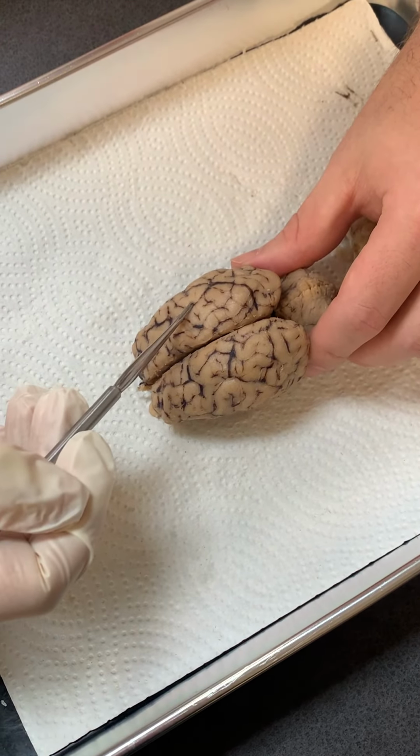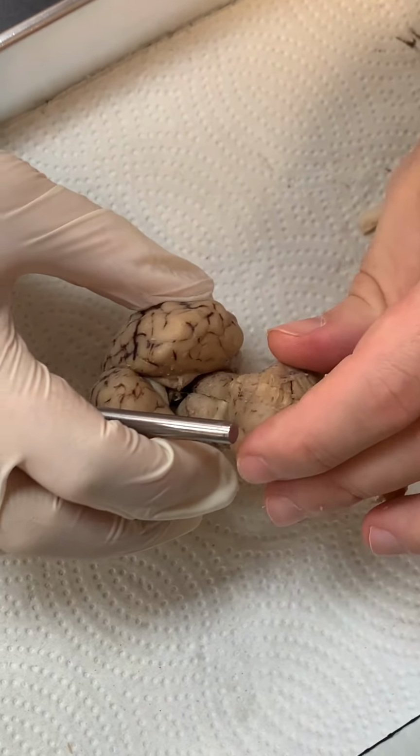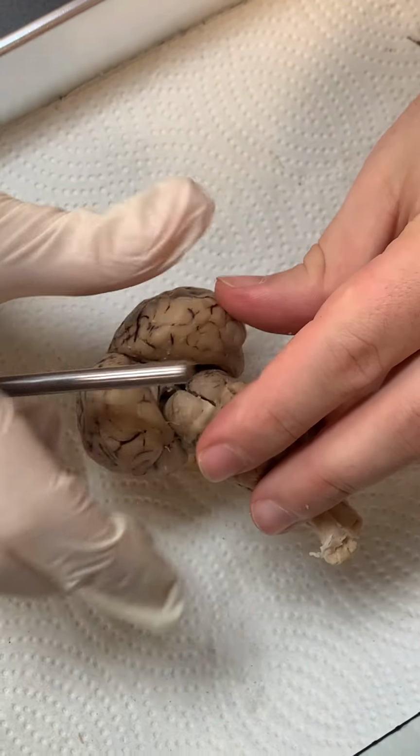Okay, we also have another fissure that is going to separate out the cerebrum from the cerebellum. And this is called your transverse fissure. When we open the transverse fissure, we're going to see what everyone likes to call the baby's butt with a hemorrhoid. And that is going to be called the corpora quadrigemina.